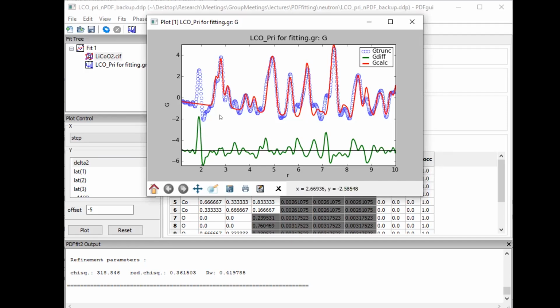If we relate to the structure, we can tell this is the interlayer oxygen, and this is the intralayer oxygen. That's what I showed when I presented the previous Joule paper we published at the beginning of the year. So this is really the strength of using Neutron PDF to study oxygen-related structural features. These 3 peaks are so easy to tell, right?